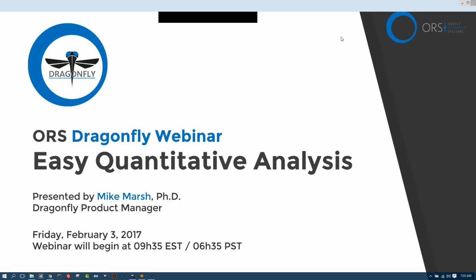What we're going to talk about today is the Dragonfly platform, the software that we make here at ORS, and how you can do easy quantitative analysis.